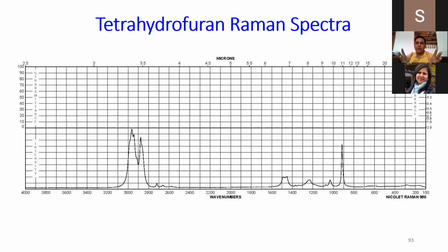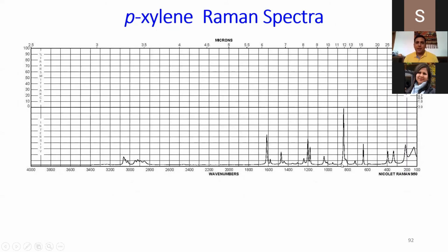Now you want to quantify the combined solution, or the sample of polystyrene, paraxylene, tetrahydrofuran. How would you quantify? Which peak needs to be considered? If you see this particular part, the peak here is at 910, right? Can you see this? Any response from anyone? Yes, sir. So you can see the peak here at 910. Now let's see paraxylene. Do you have a peak at 910? Here you have 800, here you have 900. So you don't have a peak here at 900.